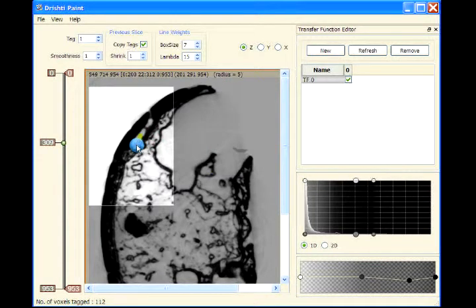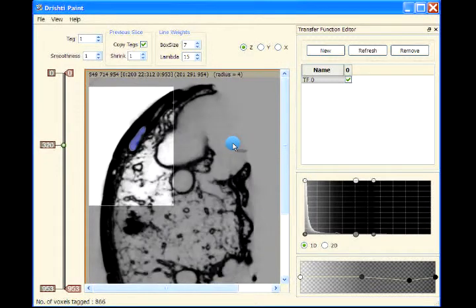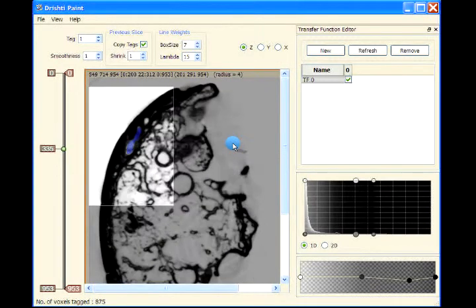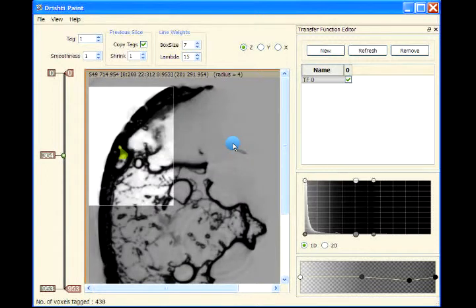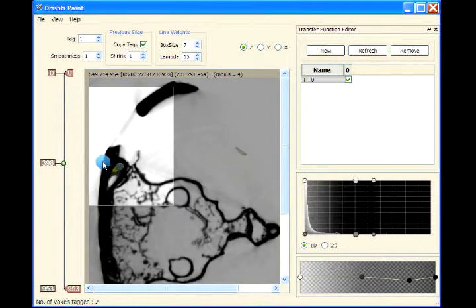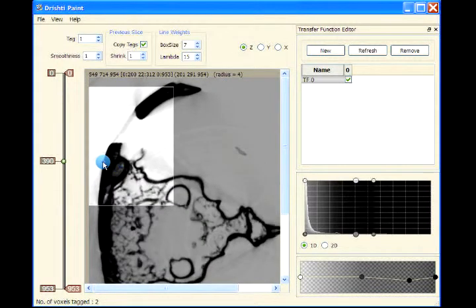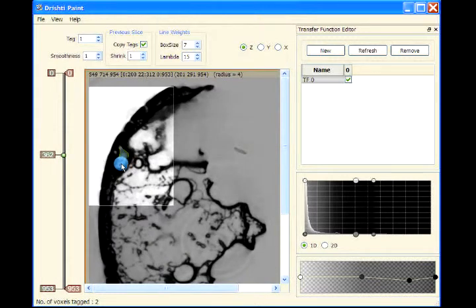And then let's add here tag, skip, tag forward. Okay, now we have to find, so this is where it disappears, and tag.